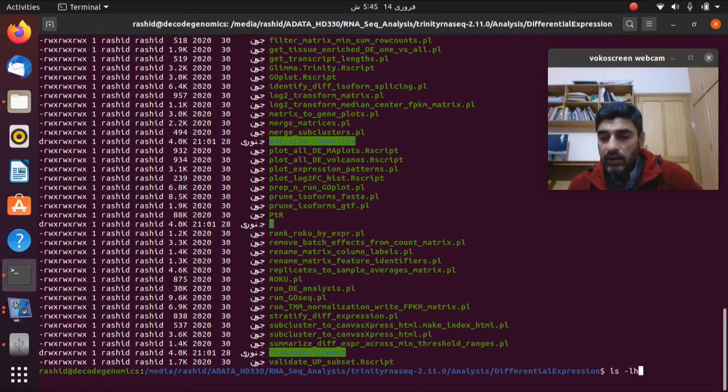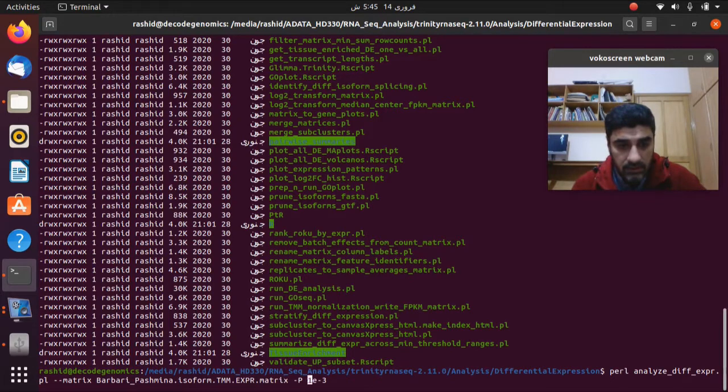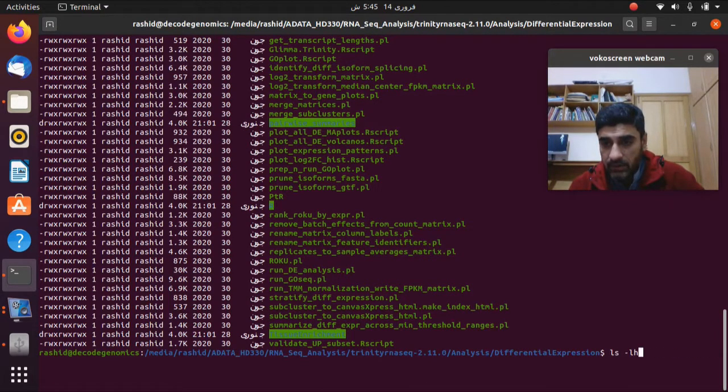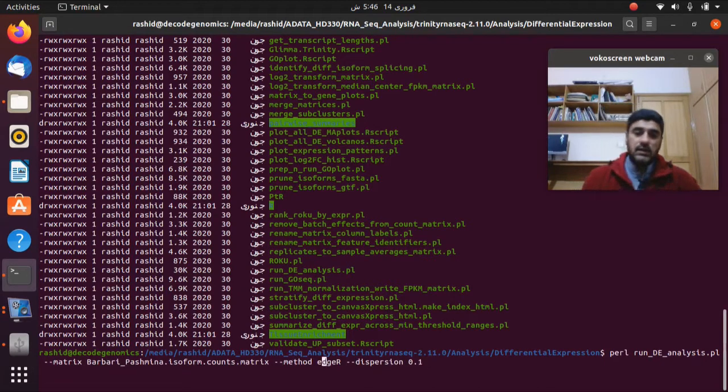Okay, I have run it before. Not this one, not this one, not this one. Okay, so this is the command. This is the Perl script.